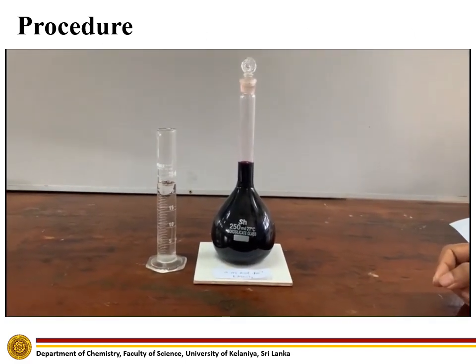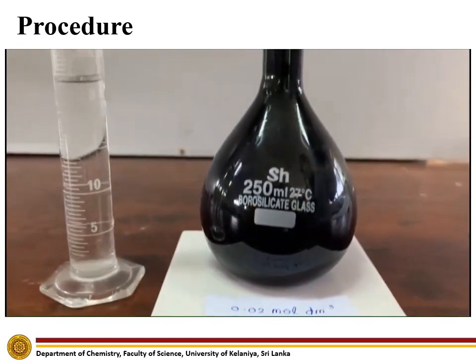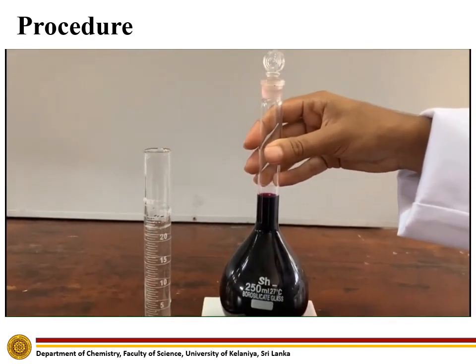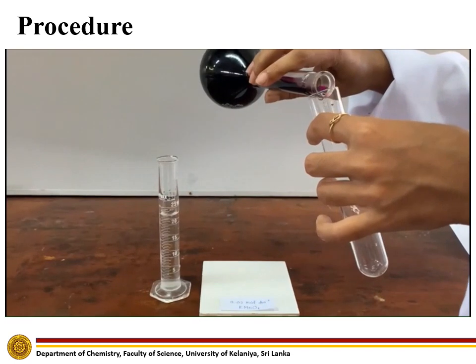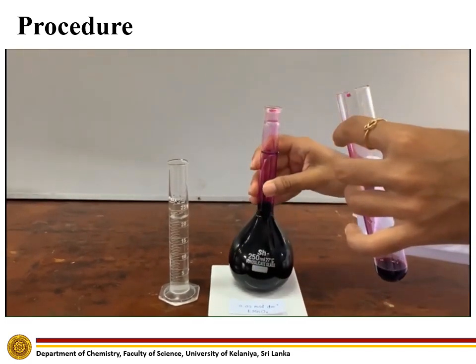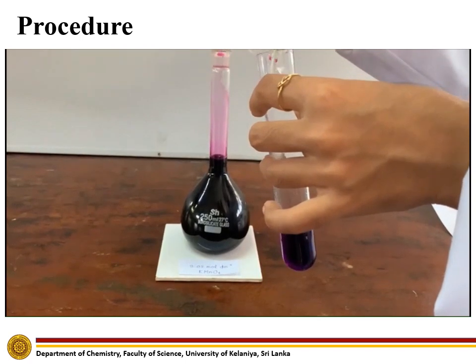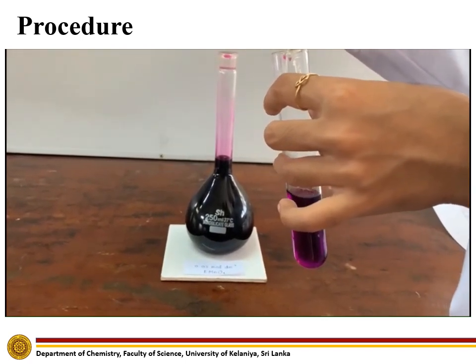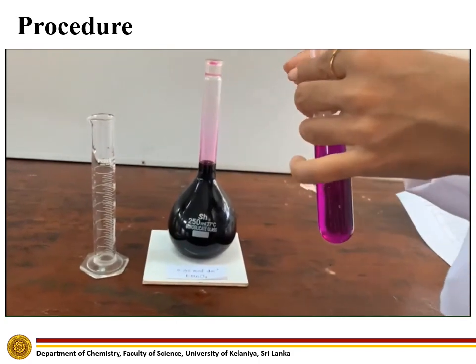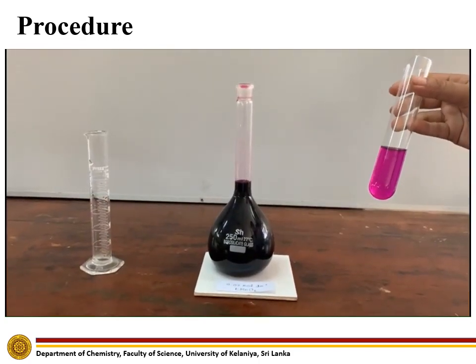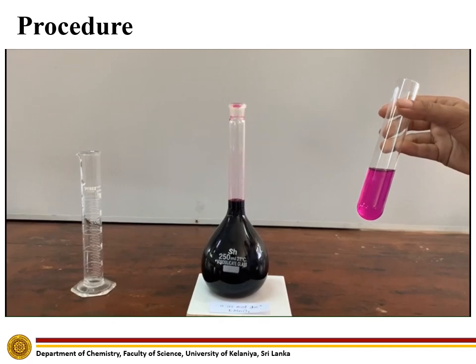First, we are going to dilute a dark purple, highly concentrated potassium permanganate solution and then observe the color. We can see that the intensity of the purple color reduces with dilution, giving a light purple color solution. Both the dark purple and light purple color solutions indicate the +7 oxidation state of Manganese.